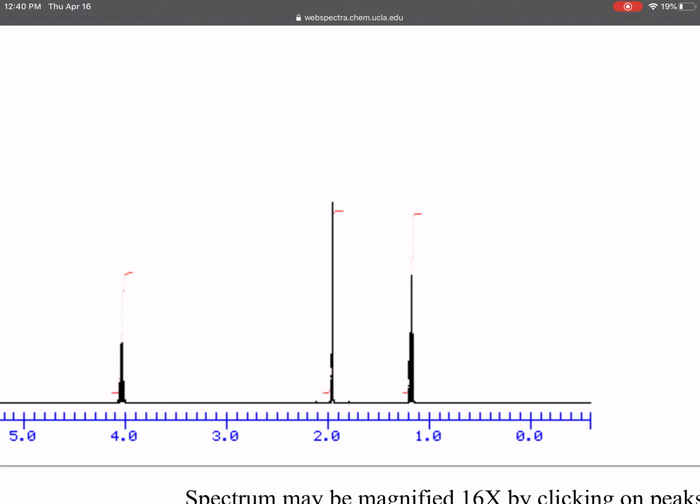Back in my day, we would literally have printouts of these, and we would use rulers. We would use rulers to measure them, either in centimeters or inches, doesn't matter. You just have to keep it the same for all of them, and we would use those as a starting point. All right, so if you happen to have a ruler or something, feel free to break it out now, pause the video, and kind of measure the lines. I'm just going to eyeball it here. For this one, I'm going to just make the signals left to right, A, B, C.